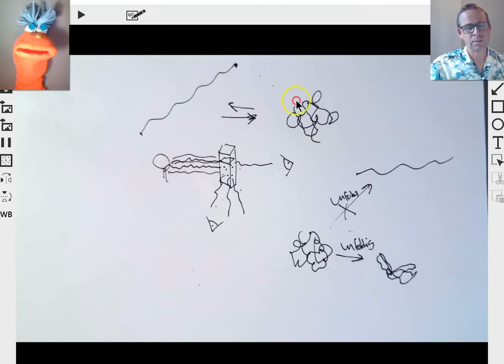These denaturants function well in terms of unfolding, but you need to have a very high concentration. So we change the solution concentration of something like urea from 2 to all the way up to 8 or 9 molar urea, which is very high concentration.